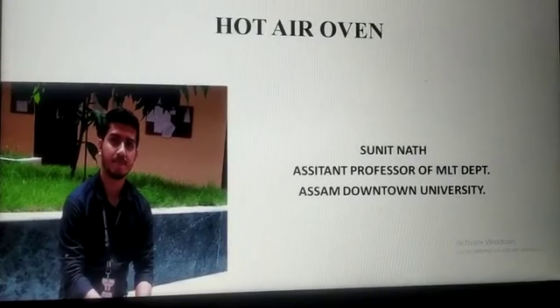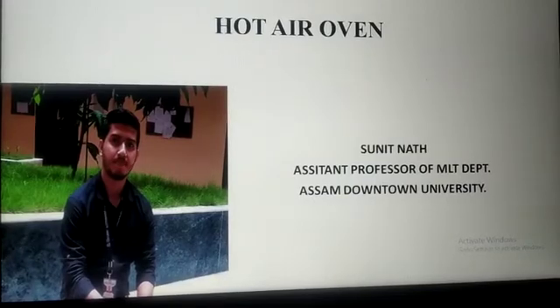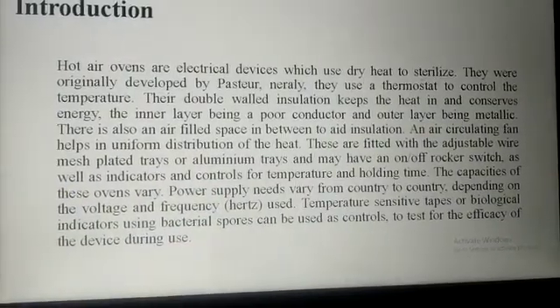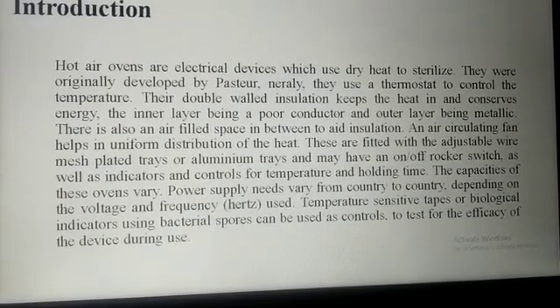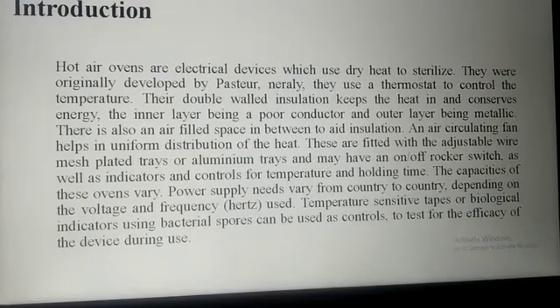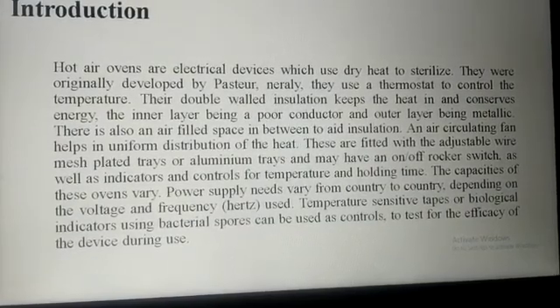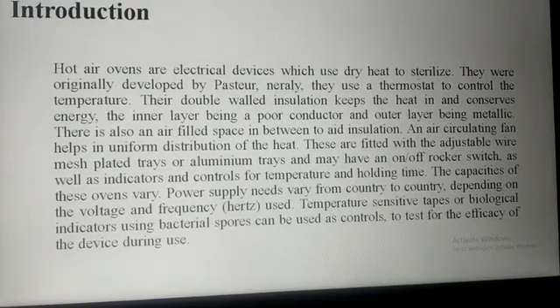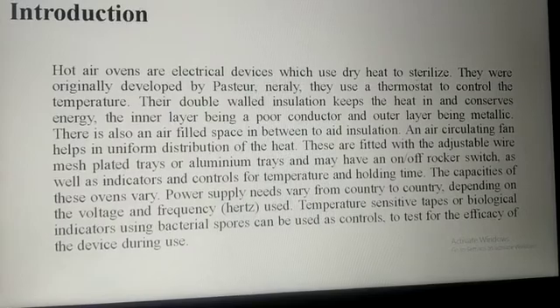Today in this video we study one of the most common instruments, the hot air oven. So first of all, the introduction of this hot air oven. Hot air ovens are electrical devices which use dry heat to sterilize. They were originally developed by Pasteur.